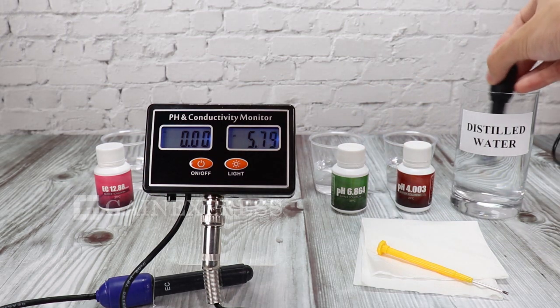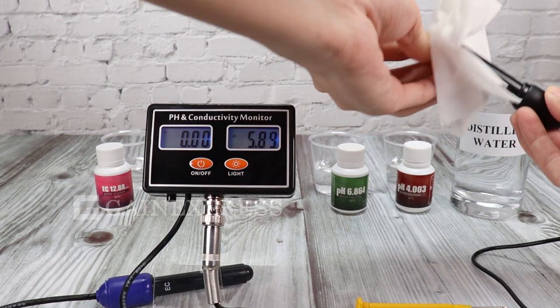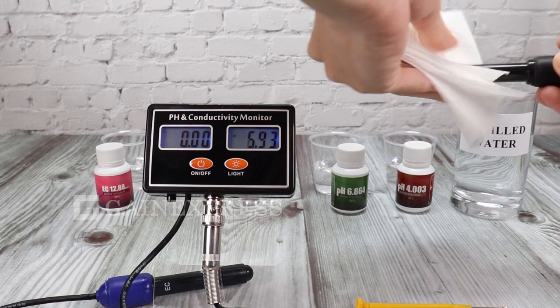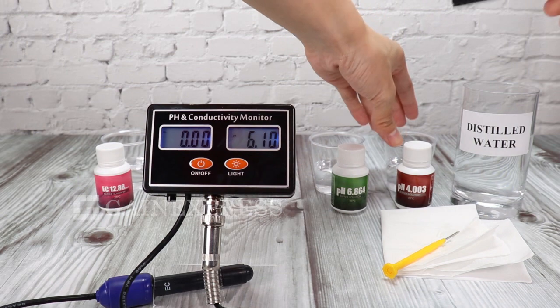Rinse the meter with distilled water after every use. Then put it again in the 4.0 solution.